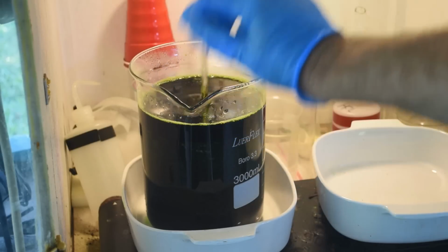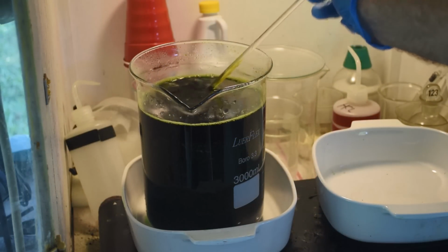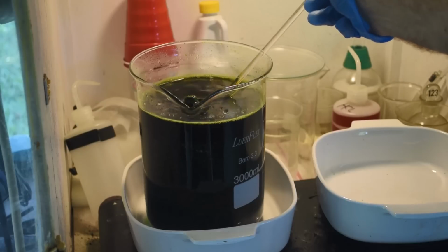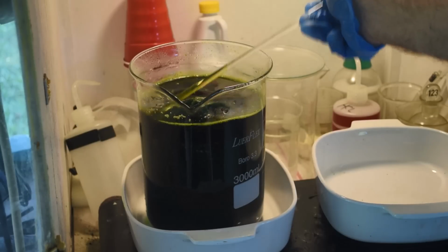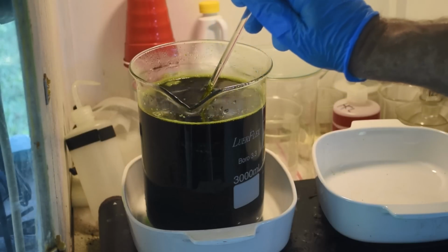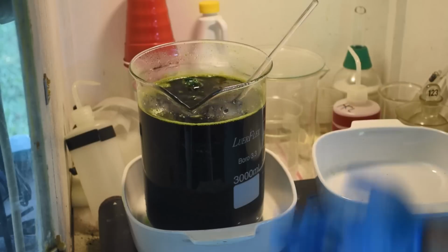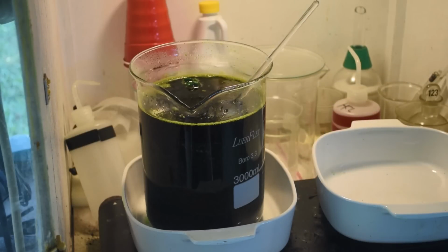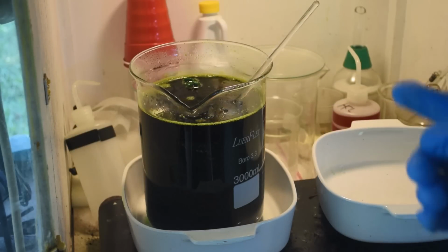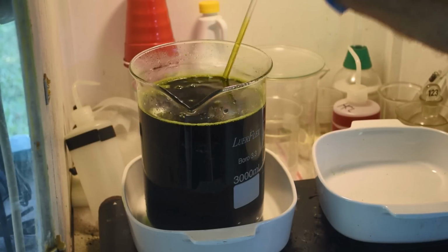So we're pretty much in the same spot with this stuff that we were at the end of the last episode. It's still got some big lumps of stuff in it that is not dissolving, and I'm pretty sure it is sodium chloride, because sodium chloride does not dissolve in hydrochloric acid. Go figure. Anyway, that's what I rehydrated this stuff with, and these big lumps have not dissolved.